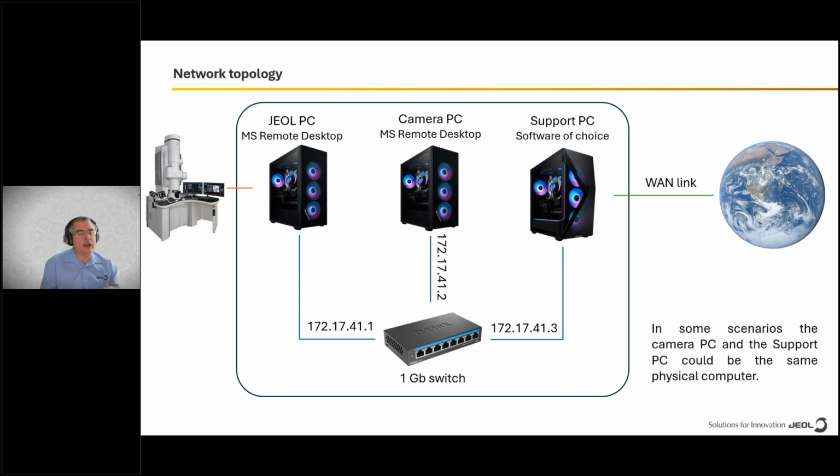This is the machine on which TemCenter is run. So you can turn on the beam or open the beam valve. If you have a camera linked directly to the microscope, you can see the JEOL camera on this computer. It does allow you to control every aspect of the microscope operation.